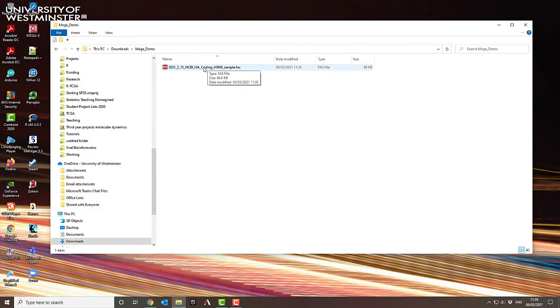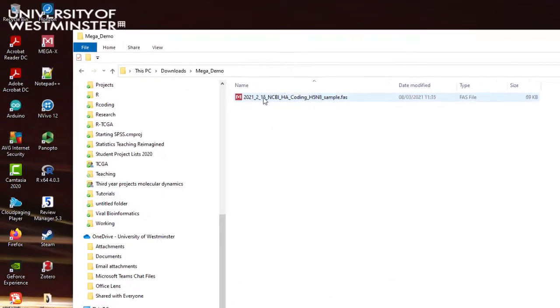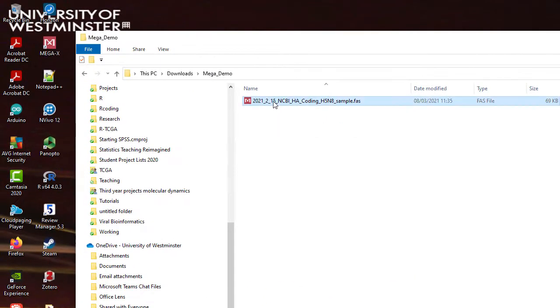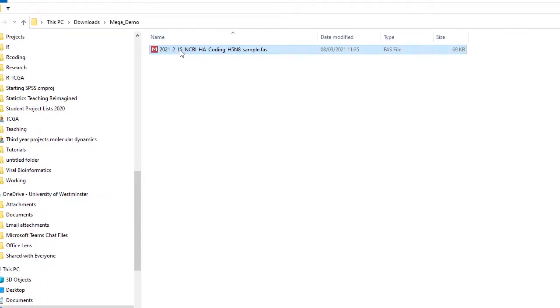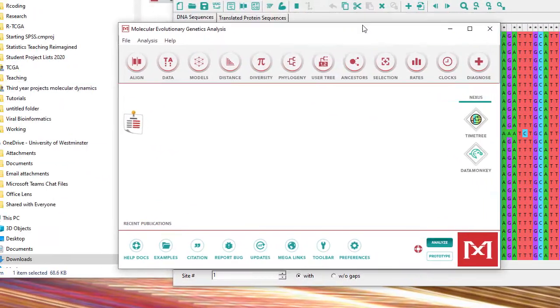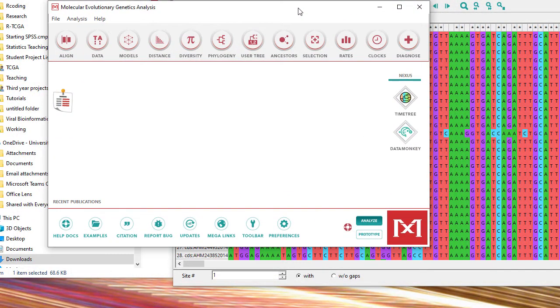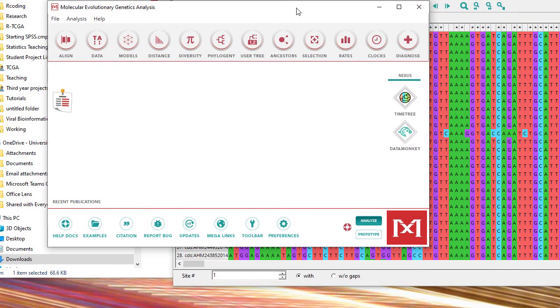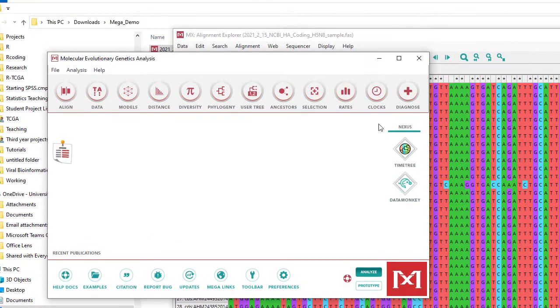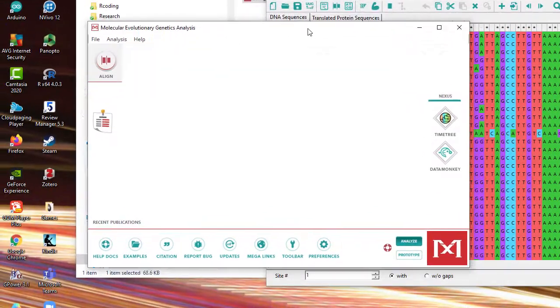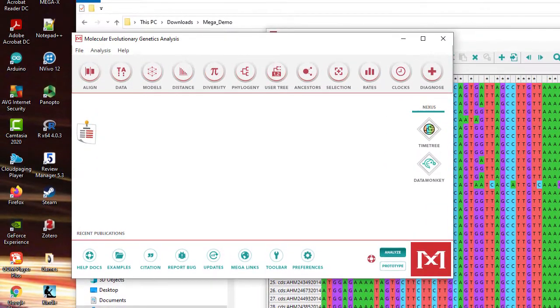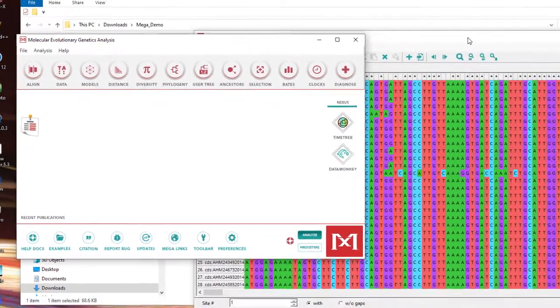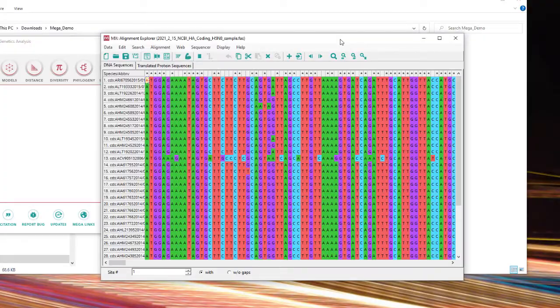I've already downloaded and installed MEGAX so that's why it's already showing that any file that finishes .fas is associated to MEGA. So if I double click on it then MEGA will open it. So in MEGAX it's very different in appearance to MEGA7 in terms of the coloring and the layout of the icons and the way it's set up and also actually the text formatting.